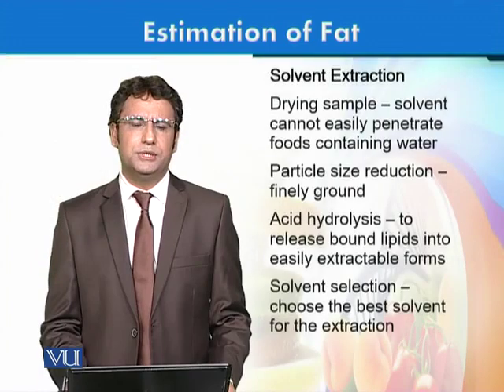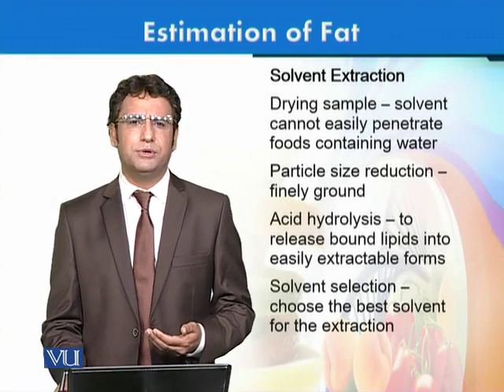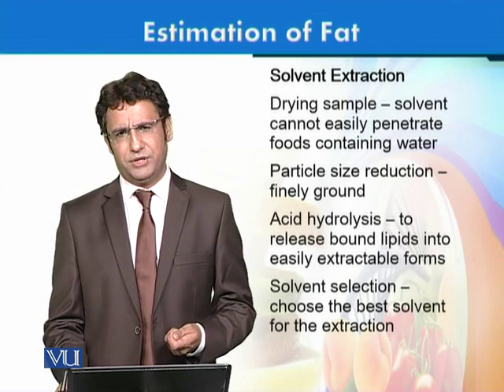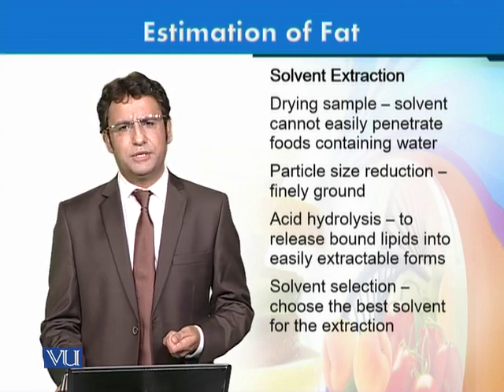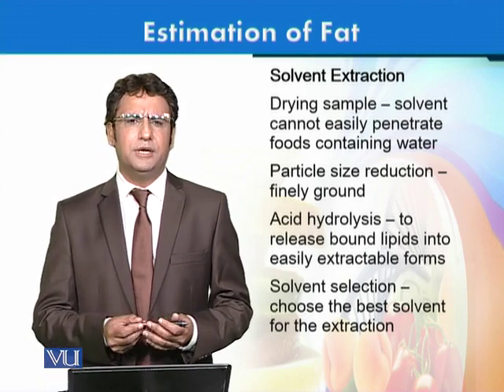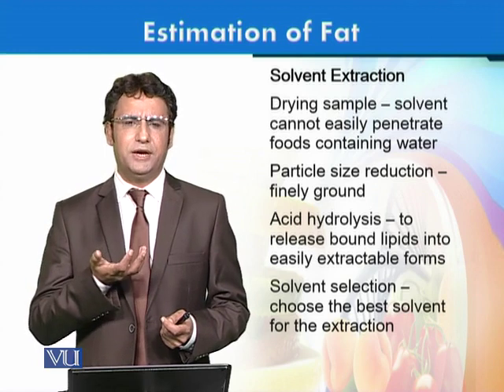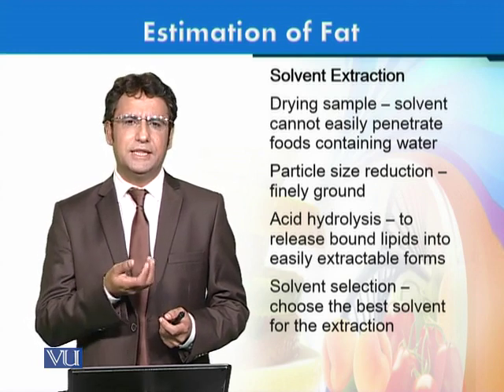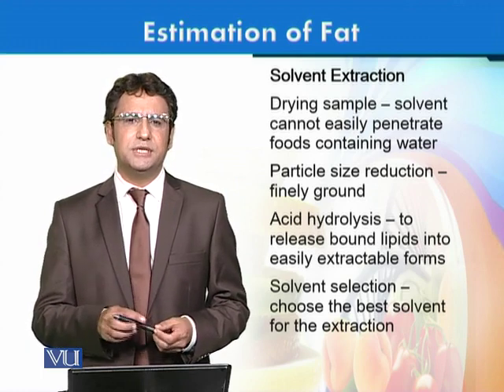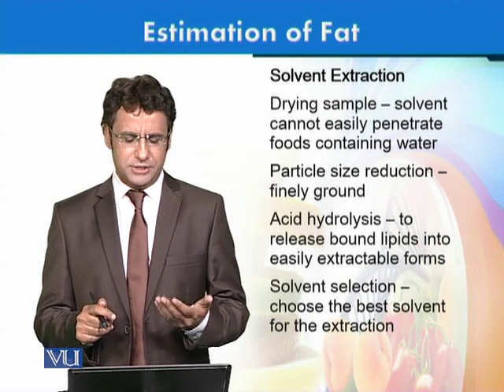When it comes to the methods of analysis, one of the most important elements to consider is the solvent that we are going to use, because all the methods of analysis of fat contents depend upon using a solvent, and that solvent would extract the fat out from the food sample, and then that extracted fat is weighed and expressed as a percentage or in terms of mass, like how much fat is present in a specific food.